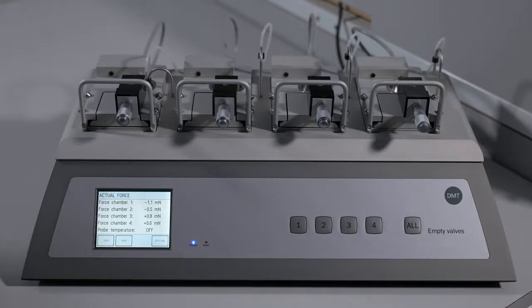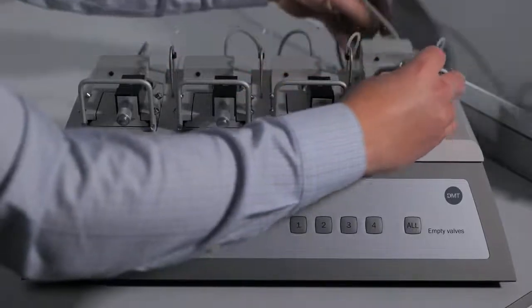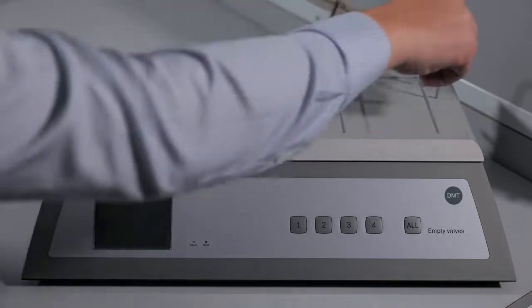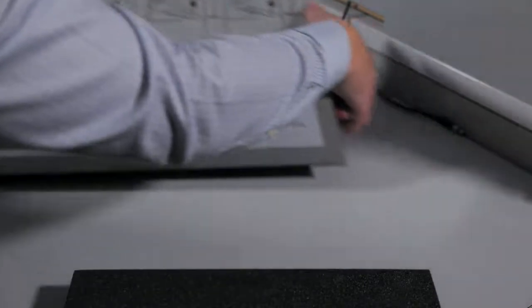If pressing the vacuum buttons does not fix the issue, you will need to open the interface and manually open the tubing. Remove all of the chambers from the interface and disconnect from power. Once you have disconnected from power, set all of the suction lines in the down position. In order to open the interface, you need to access the back panel and underneath the interface. You will need something soft like foam or styrofoam to rest the front edge of the interface on.